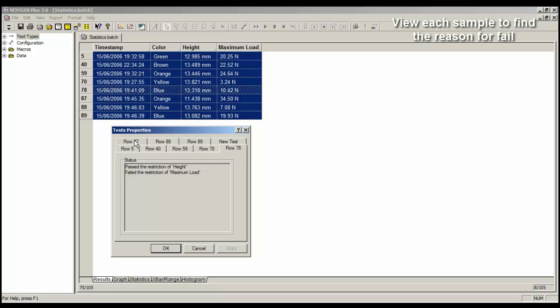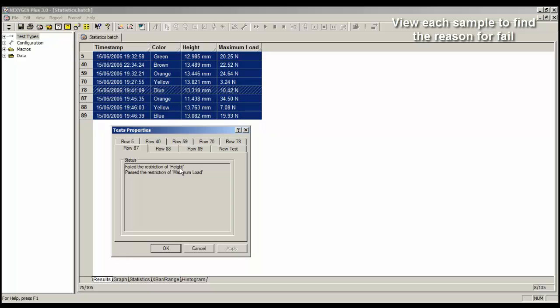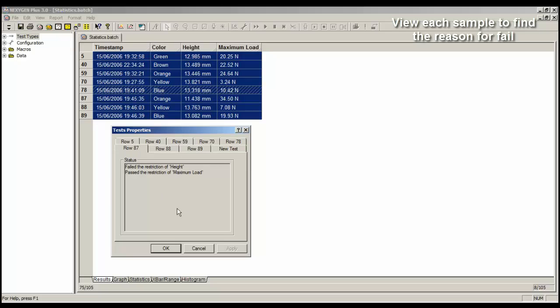87, 87 failed height. So 87 is a failure because the height was incorrect. Let's look at row 88, passed the height. 89, also passed the height. So looking there, we can see that row 87 is the only row that failed because the height was incorrect, or outside of our limits.